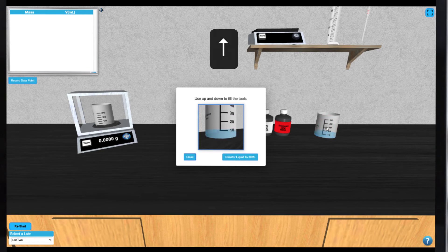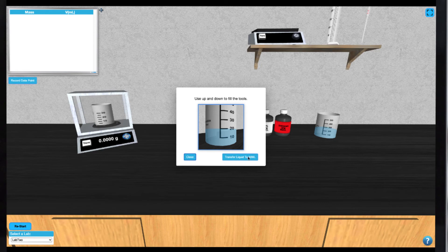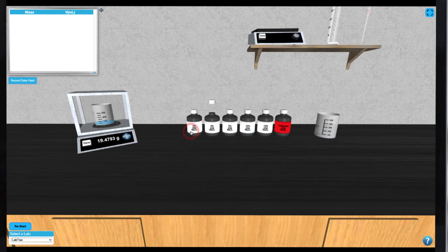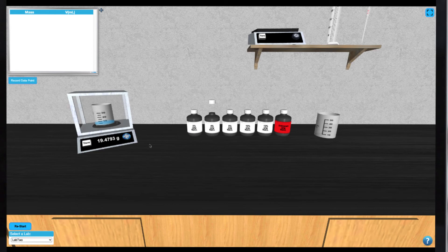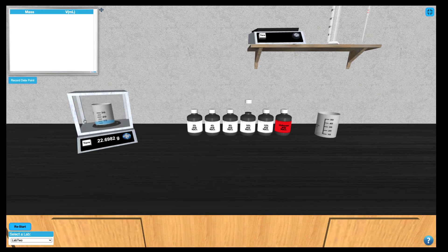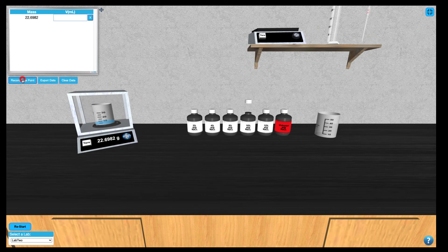Now you can draw up that liquid into any of the glassware you select. Again, using your up arrow, you can fill the glassware to the desired volume and transfer to your 30 mL beaker. Once transferred, you can weigh the mass of your sample as you did in Part 1. You can use the data logger in the top left of your screen to record data points as you go.